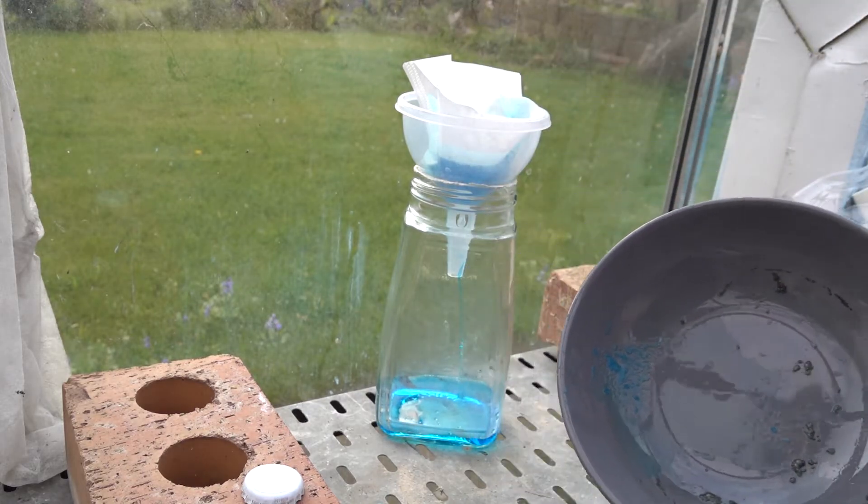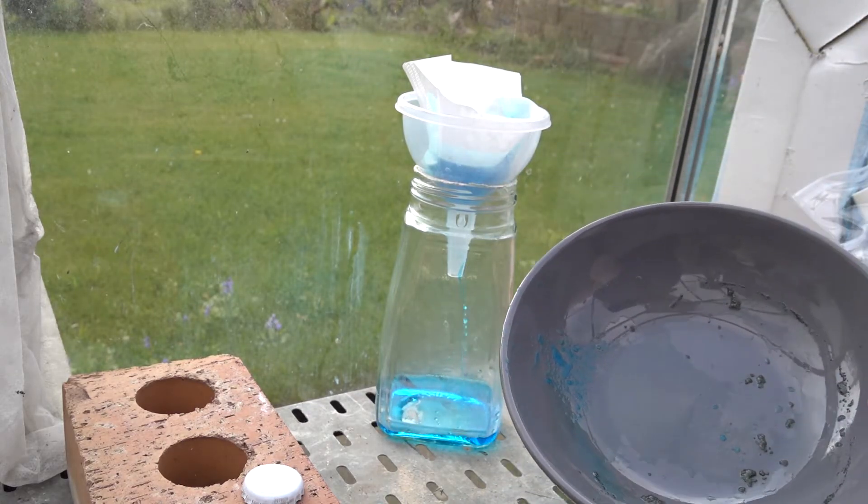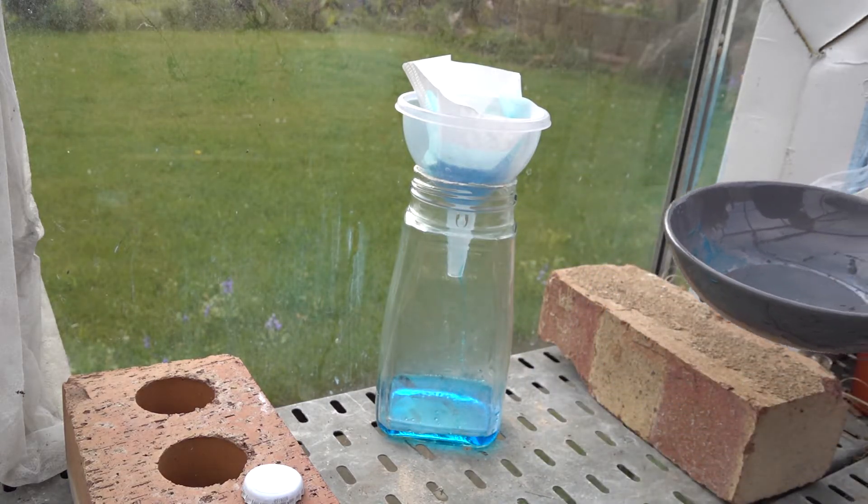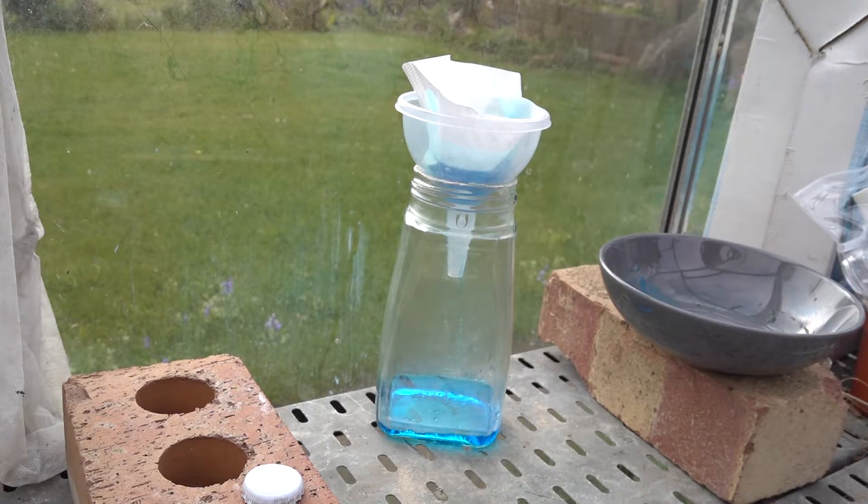You can see it's filtering quite quickly actually. You can see impurities left in the bowl here. So that's going to take a few minutes to filter. We'll turn off the video and come back in a few minutes.